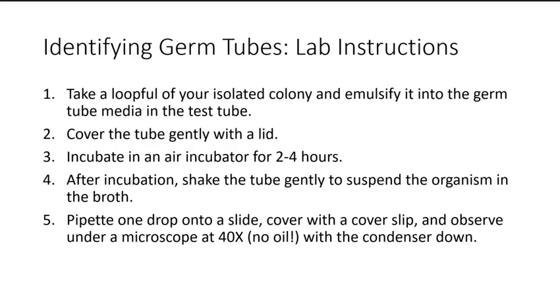Every day you do a germ tube, you have to run a positive and negative control, which is called each day of use QC. And you have to obviously use known organisms there, so you can guarantee that what your patient result is will be consistent with the positive and negative that you should see when you run your QC. So the positive control is obviously Candida albicans, and the negative control, we use Candida tropicalis.